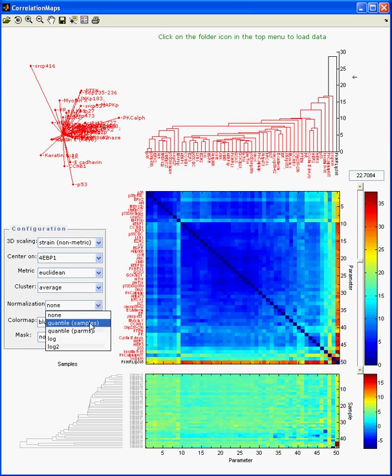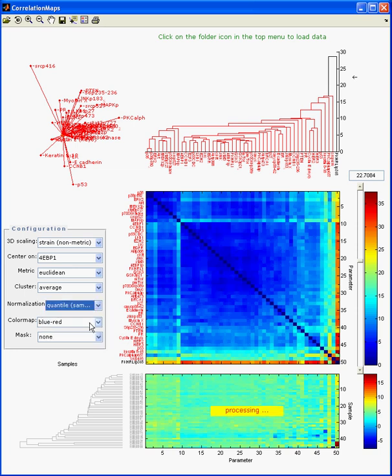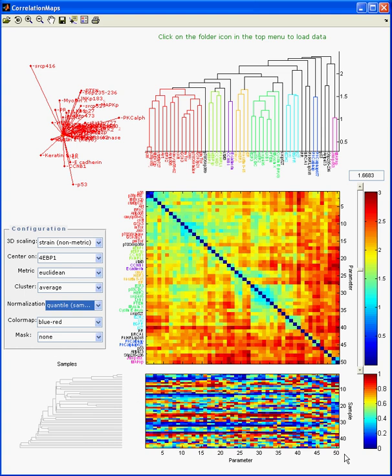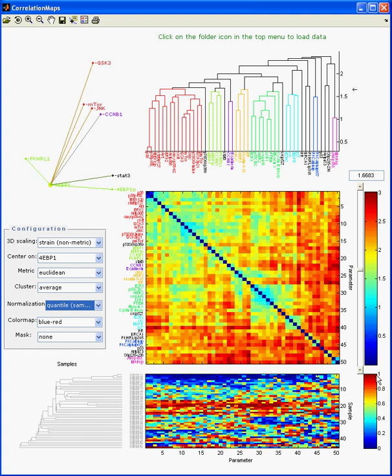Let's do quantile normalization by sample. And now the values go between 0 and 1, as they should. You see the values represented now according to this color scheme. So these are the samples, and these are the 50 antibodies — the 50 parameters.